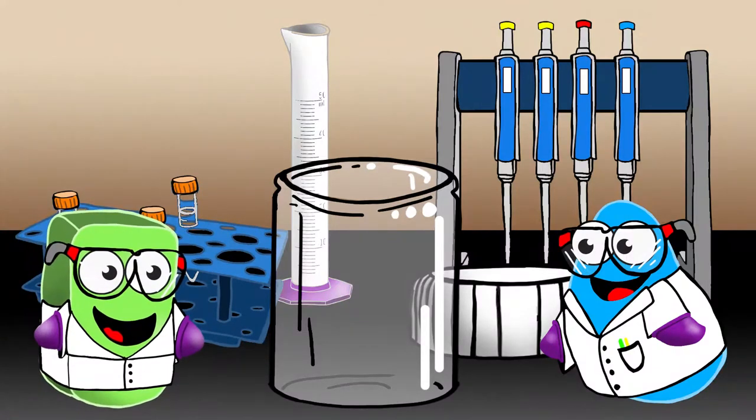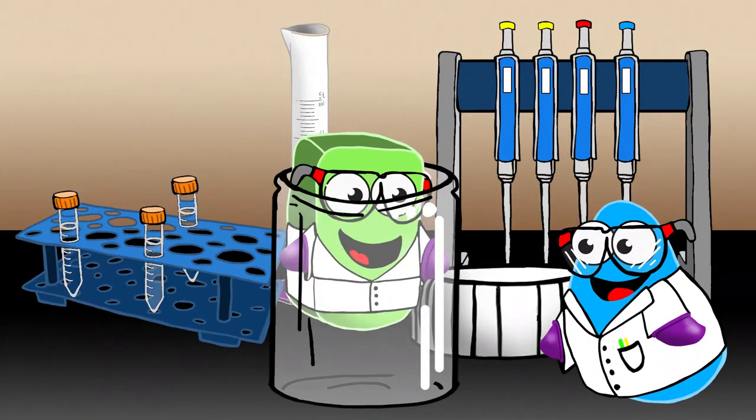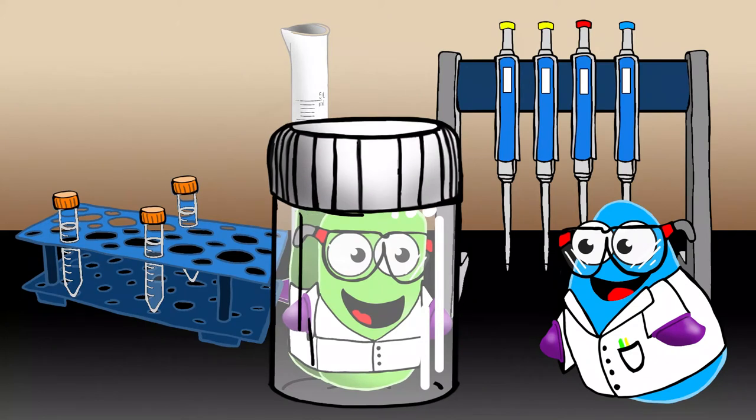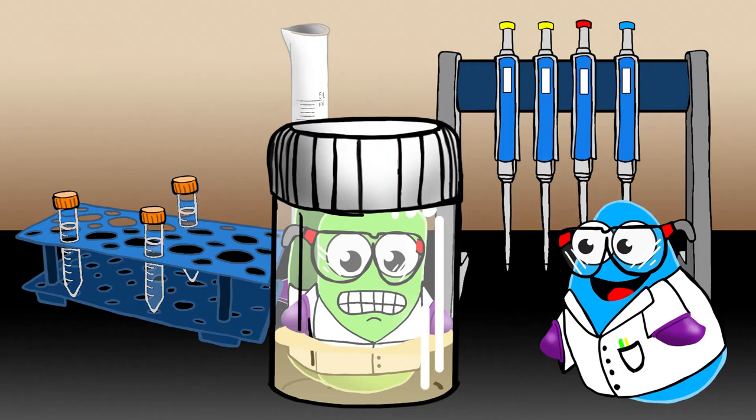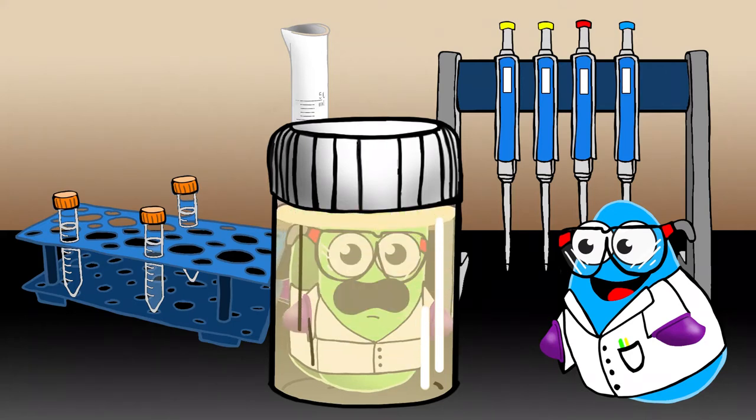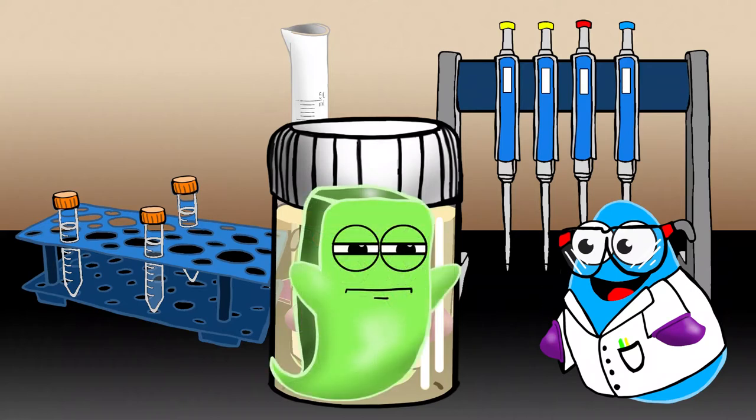Now Annabelle, I need you to get into this vial. Samples for the TEM are fixed with a variety of chemicals. These chemicals cross-link the proteins, lipids, and DNA molecules in the sample so that the structure is locked in place. I'm too young to die! I will haunt you!